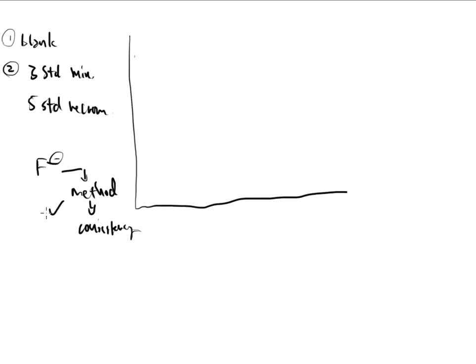So that is kind of good news for us. It limits what we have to think about. So we follow a set of instructions, we do what's written on the sheet of paper, we don't question it, we run them, and everything is okay. But what if we have to make the decision ourselves? What if we're doing a new method that requires a set of standards that we've never done before, and part of your job is to help with method development?